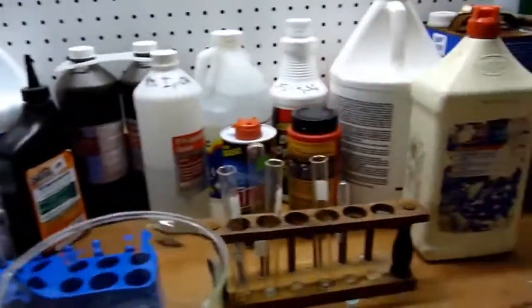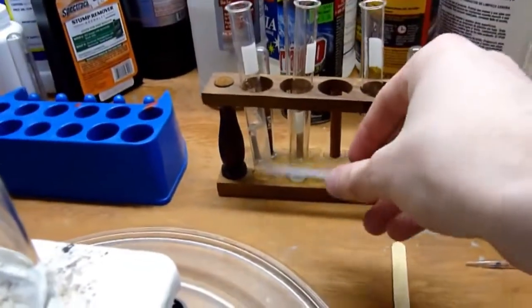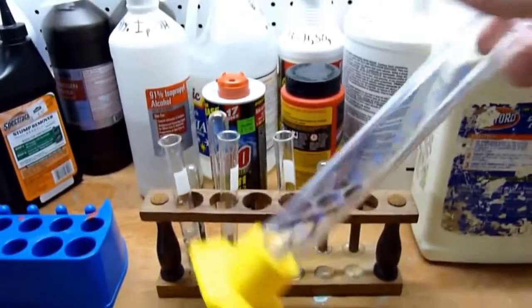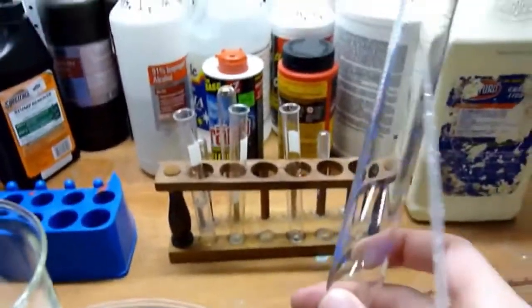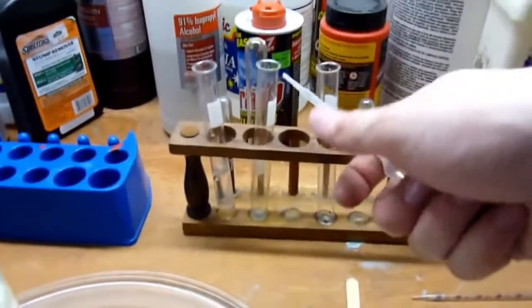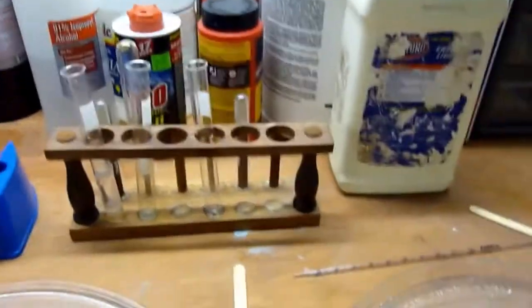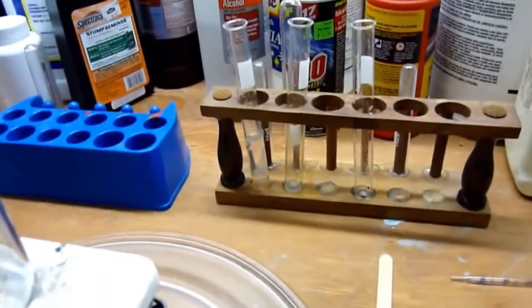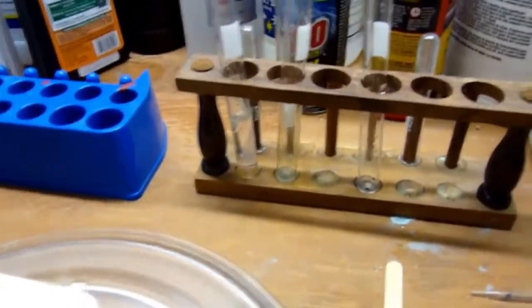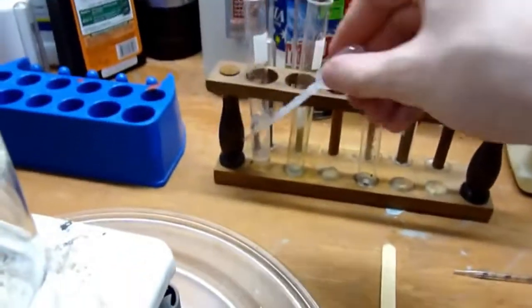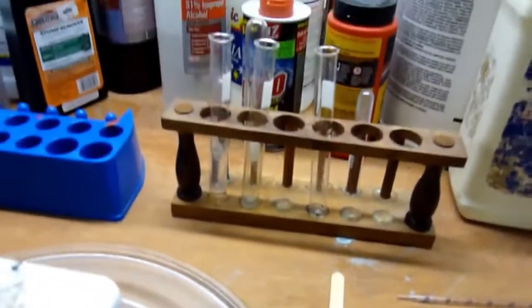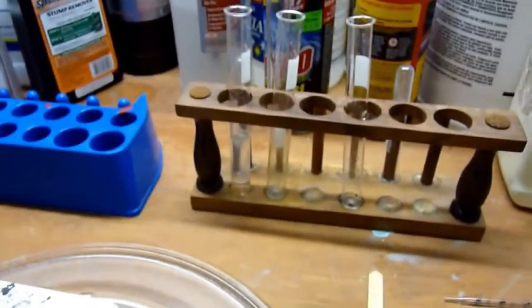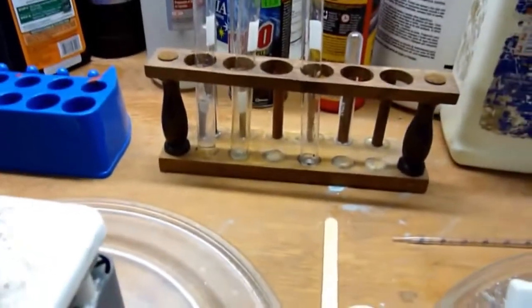And in fact, you can actually use the volume of gas produced from this to determine the concentration. All you simply do is get a graduated cylinder, like this, and just invert it. Fill it with water. Fill it well, then invert it into a tray of water. And then run a tube from the top of the test tube. You know, maybe a stopper with a hole in it. A small tube into the graduated cylinder so you can measure how much gas is produced. And as a general rule, 3% hydrogen peroxide will produce about 10 times its volume in gas. So if you had 1 milliliter of 3%, you would end up with 10 milliliters of oxygen gas in the tube. And obviously you can use proportions from there to determine anything higher in concentration.